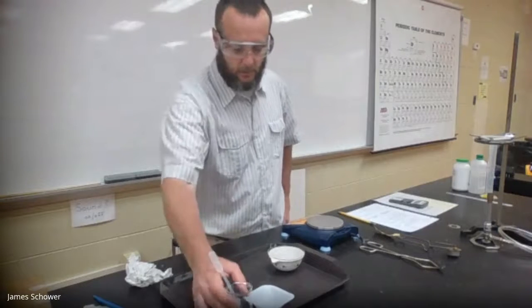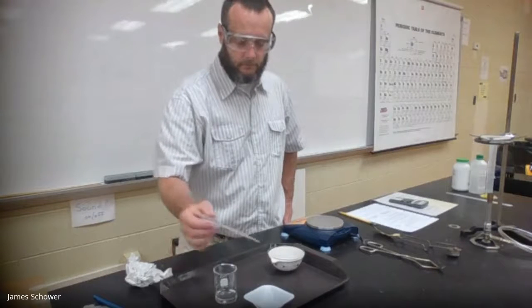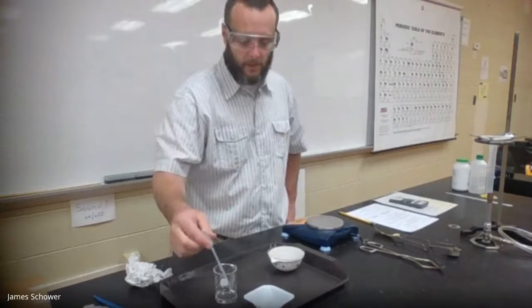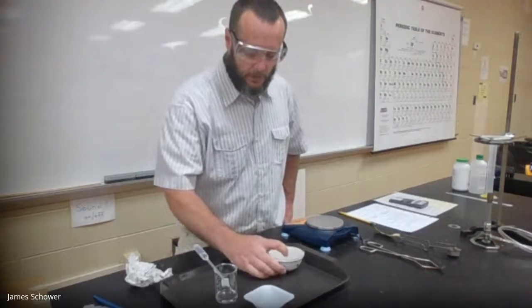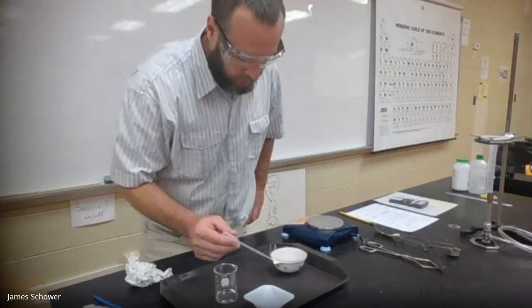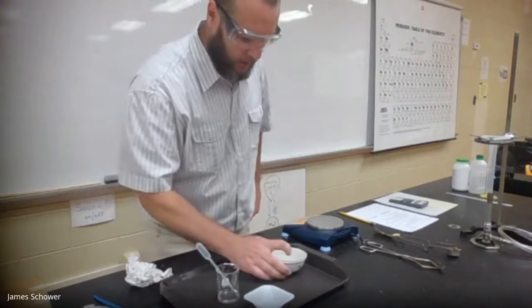Still bubbling, still bubbling. I would love to show you guys, but if I tilt it, it's going to pour all over my hand, so I can't. So just have to trust me on it. I'm going to give it a gentle little swirl. Okay, no more bubbles. That was the last check.